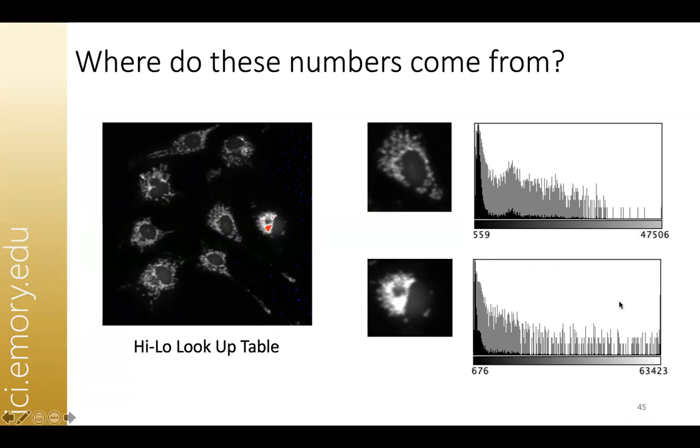So again, rehashing everything, it's very important to make sure that you plan your experiment in advance. When you are on the microscope, you make sure that you're not saturating your image when you are using a particular laser power or particular high voltage and so on. And at the end, a good image will help you get good data, and use the tools in an appropriate manner, okay? So with this, I'll wrap up today's lecture.